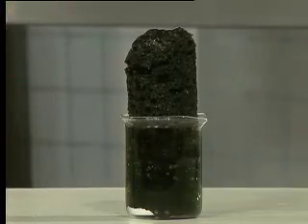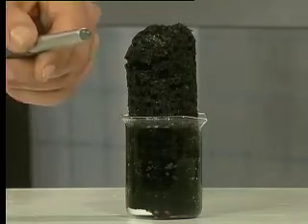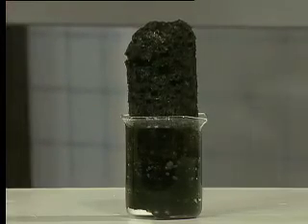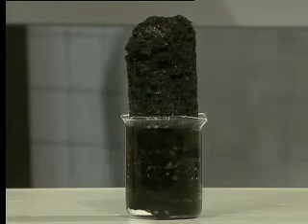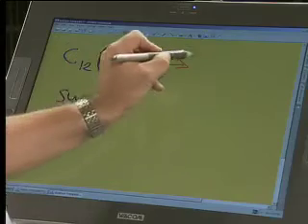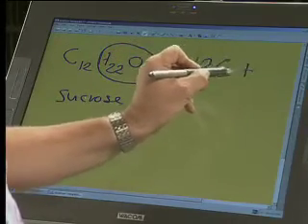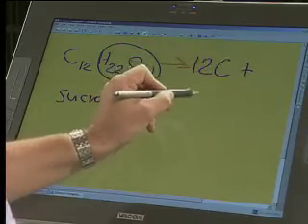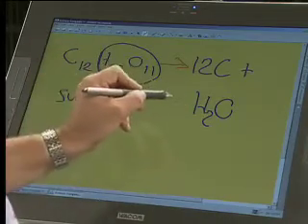I've got some SO₂ floating around, but that's great — we're getting great visuals of the solid lump of black carbon. Just quickly to wrap up: we've extracted all of that water, and we're left with 12 units of carbon, plus the leftover water, H₂O, and we need to have 11 of those.